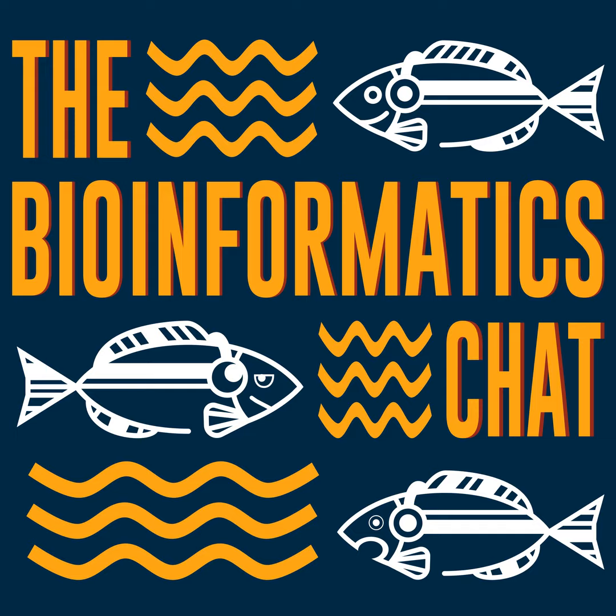It depends on the application. So there are methods that can be used to combine these automatically, for example, with micropumps and more automated lab software, which if you wanted to generate more than just a few tags, you would absolutely want to try a method to combine them that suits the scale, which would be automated in this case. Oh, this is very cool. So you would sell a machine, right, that would automatically just mix these molecular bits, small bits? Yeah, I don't know if we would sell the machine, but we would certainly be able to support mixing in that method.